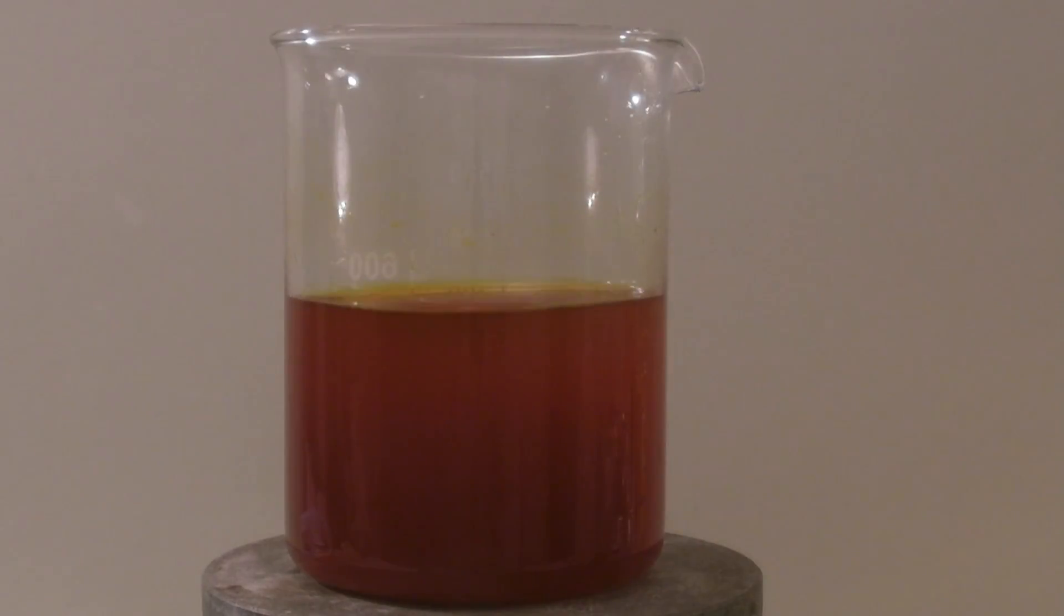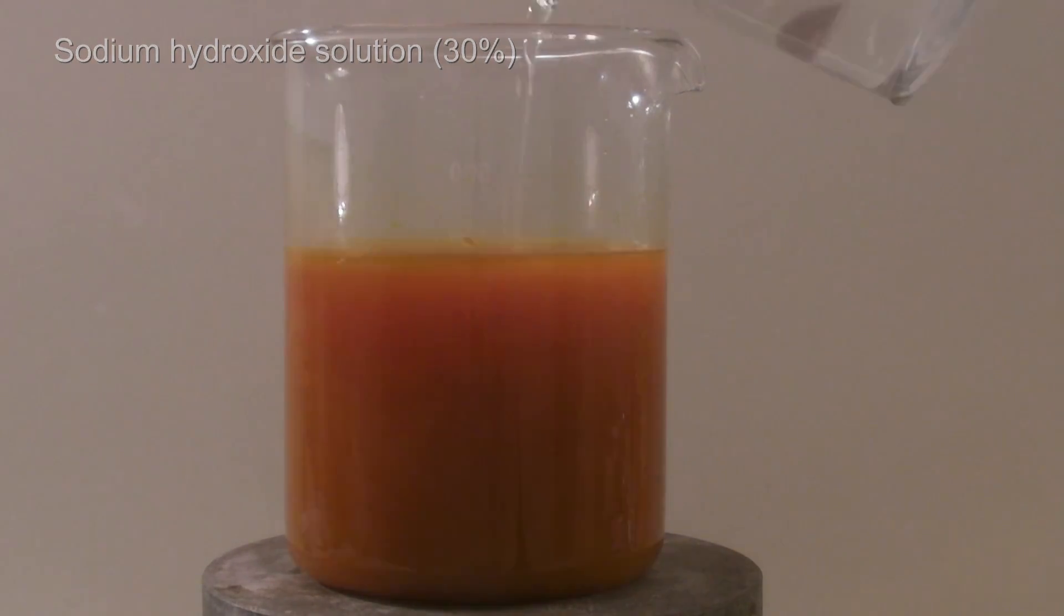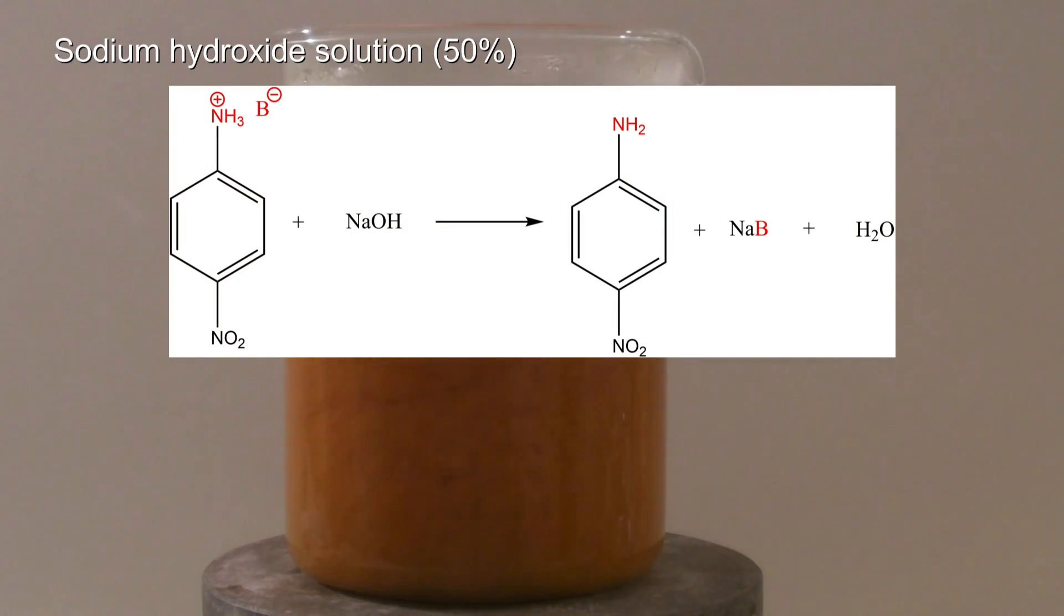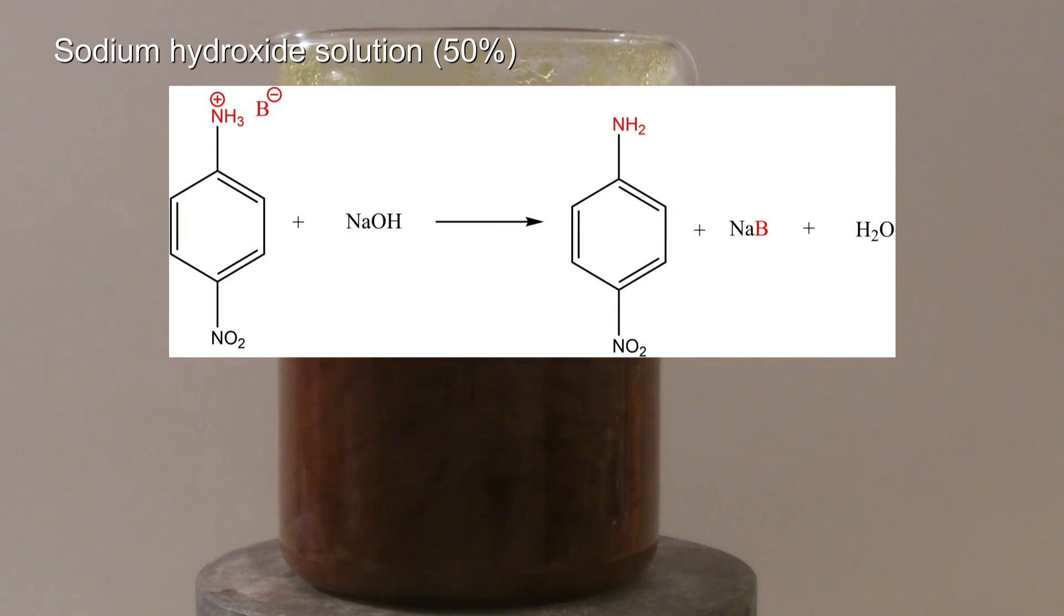The filtrate was made alkaline with 30% sodium hydroxide solution. Towards the end the beaker was almost filled up so 50% sodium hydroxide solution was used. After the addition of the sodium hydroxide solution the p-nitroaniline and the side products are present as the free base and the sodium salts of the acids are formed.